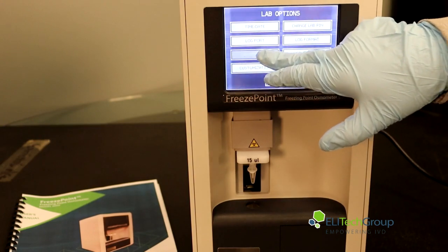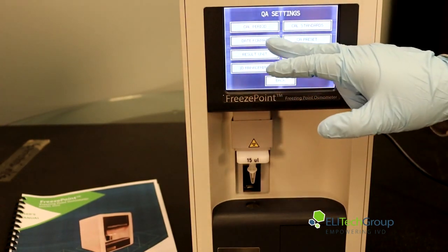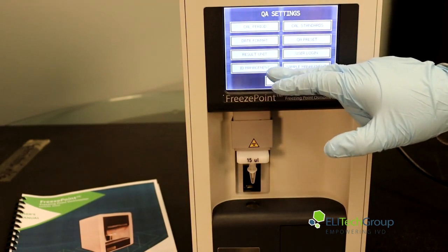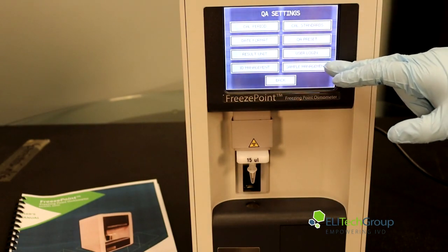You can go into your QA settings, where you can access your calibration period, date format, result unit, ID management, calibration standards, QA preset, user login, and sample management.